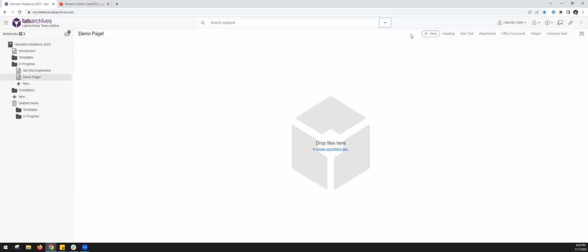But being able to find it can be tough, especially when you compare it to the old school paper notebooks where you go, I think Jim worked on that. I think that notebook's over here. And I think it was over here, but maybe it's halfway through. And yeah, you're just having trouble tracking down that paper notebook or finding the files or keeping track of the work that was done.